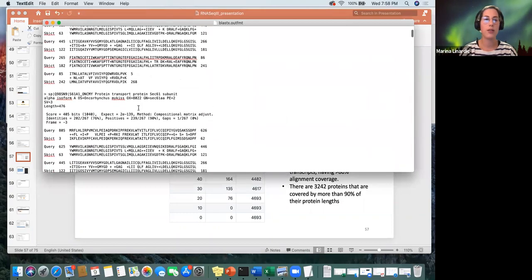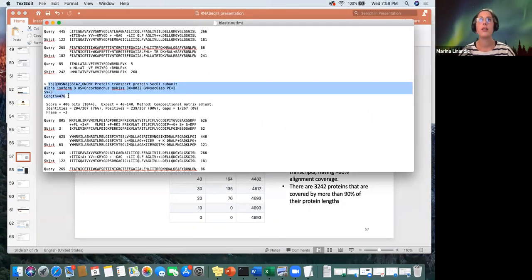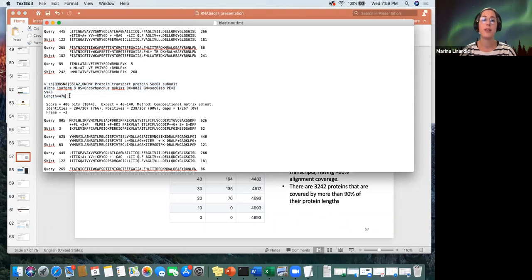So it gives you this information. It doesn't specify the version, but what you can do, I guess, is to look in UniProt, because this is a UniProt database. You can look at the ID number, if that answers your question. Yeah, so this is all the information, and this cannot be changed because this is encoded within the UniProt file that we downloaded. But of course, you can take all of these and go have a look at it online for more information.